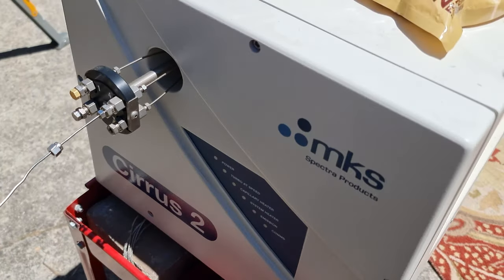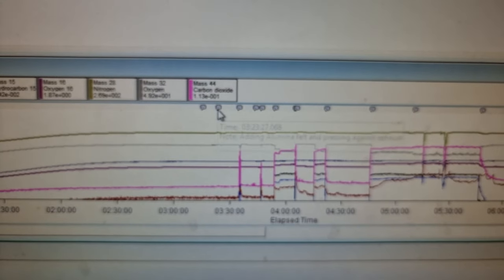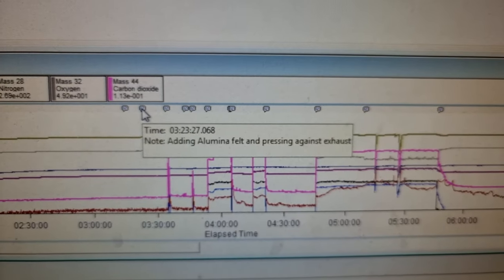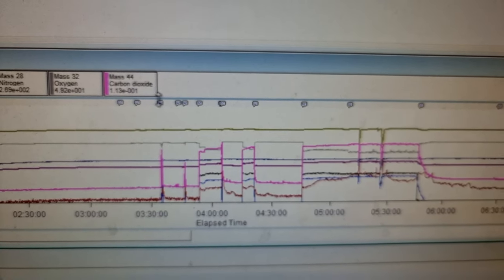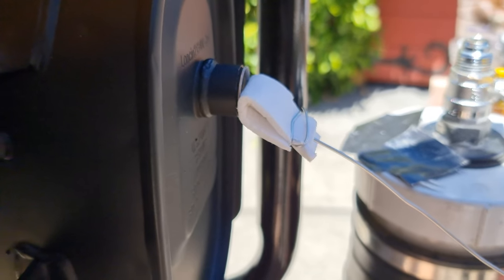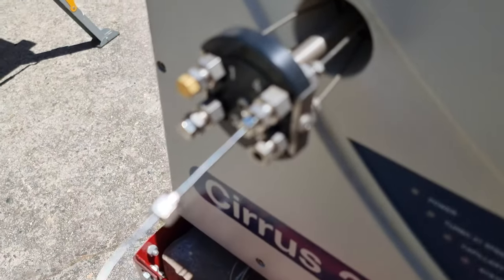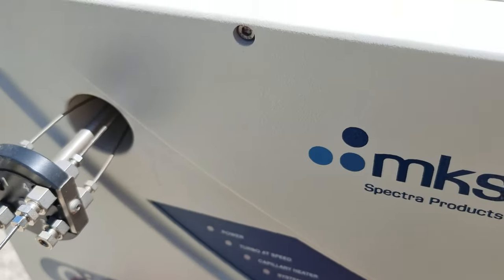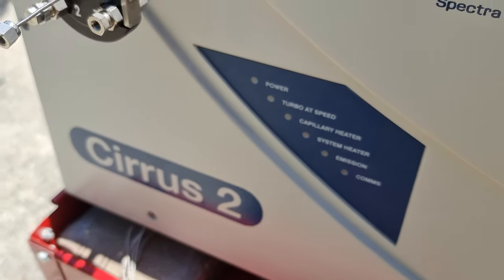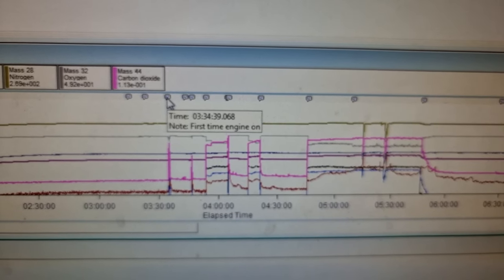This is the filter to try and get rid of any PM10 particles and large lumps of carbon that we don't want going into the Cirrus II. This was the alumina felt to try and hold it on. So there it is — the finished assembly with the smoke filter in there and the alumina felt, going into port 4 on the Cirrus II. And this was turning the engine on for the first time.